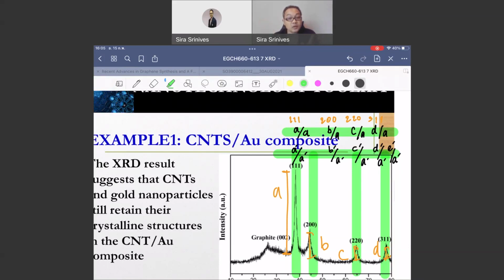After that you would like to know how your sample compares to his. So you operate XRD and normalize your curve and compare it that way. That way, you'll be able to tell the similarity between the two samples crystallographically.